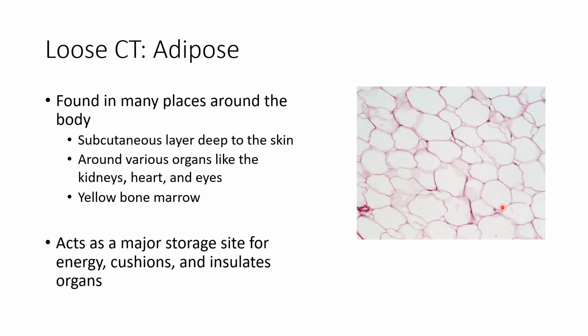here's another one there. Effectively, what is happening is there is a structure inside the cell called a vacuole, and it holds all of the fat. That's what's storing your fat. It gets so big that it pushes the nuclei to the side. So instead of seeing what we typically do with a cell, which is here's a cell and there's the nucleus, with adipose tissue we have a cell and we might see a nucleus sort of over here on the side.